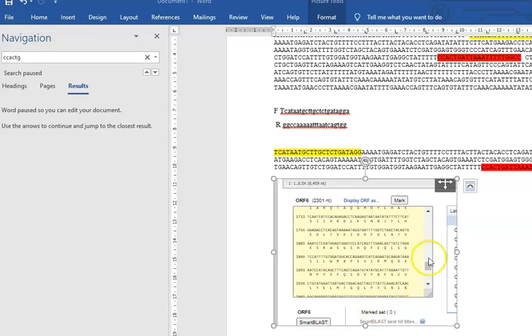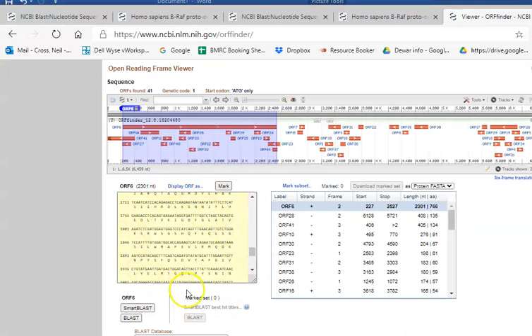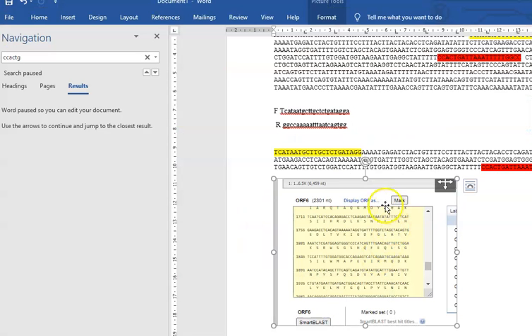Okay, all I've just done is taken a little screen grab of that open reading frame that we were just looking at. So if we go back, I've taken a little snapshot of that view so I've got the sequence in my Word file. There we go. So this is the region here that we're interested in, this line that contains this GTG valine. I'm going to check that this sequence is present somewhere within here.